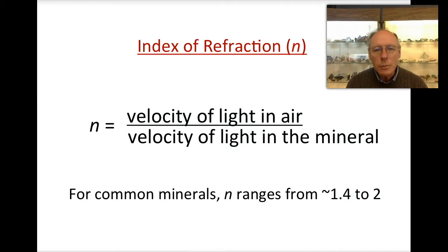Today I'm going to be showing you how to do what's called a Becke line test on the microscope. But before we do that, as background, we need to understand a few things about indices of refraction. A fundamental property of all minerals is that they have an index of refraction. And as you can see, the index of refraction is defined as the velocity of light in air or a vacuum divided by the velocity of light in the mineral.